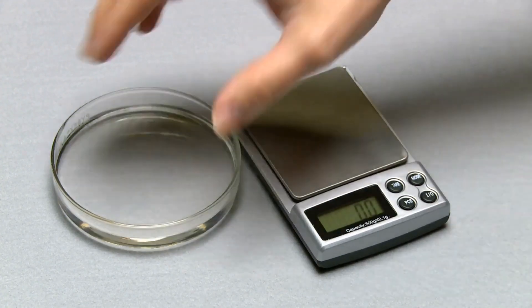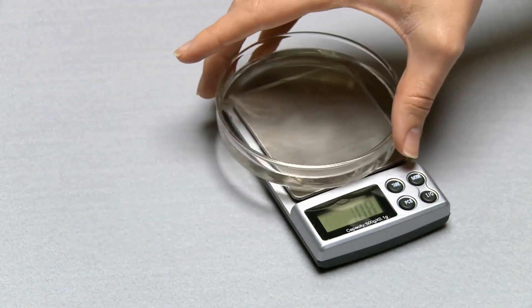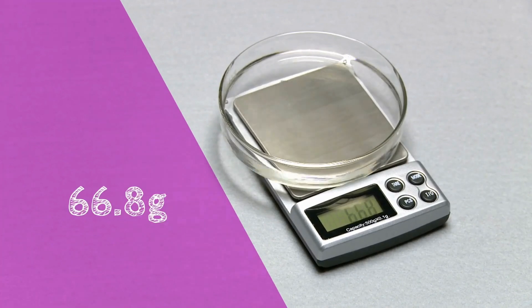Now we'll measure the mass of the ethanol that's still left in the petri dish, and its mass has gone down to 66.8 grams.